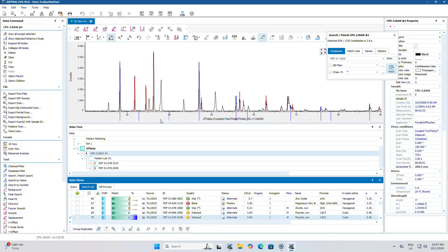Okay, now you still have unknown peak. Okay, still have unknown peak, and then you can keep going to find by click keyboard. Okay, still same zincite. You just focus to unknown peak.